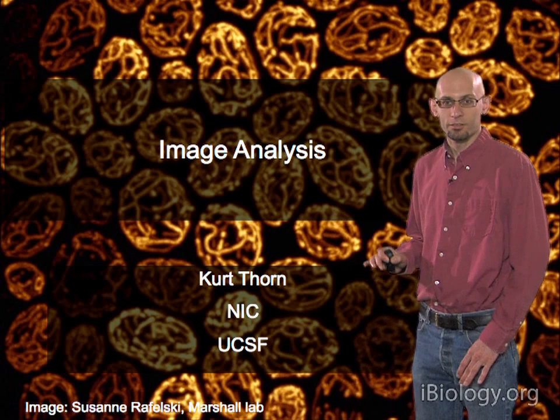And so ideally, you'd like to use a second channel you're not quantifying on to independently define the objects to measure. The idea here is you'd have some channel that uniformly labeled all your objects to detect, independent of the thing you wanted to measure, so that you could, in a rigorous and unbiased fashion, pick out all the objects. And then inside those objects that you detected, you would just quantify this other signal.